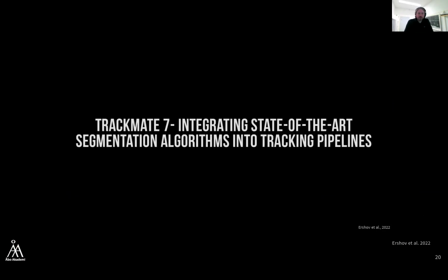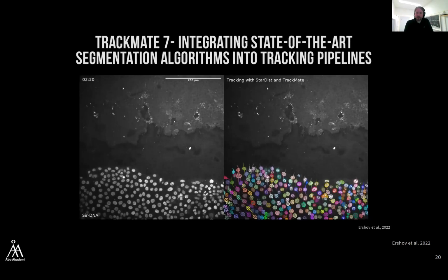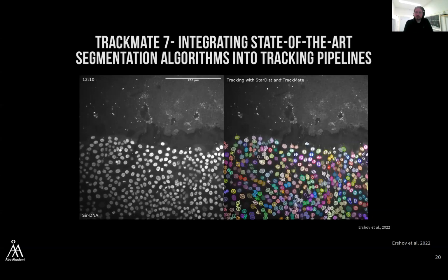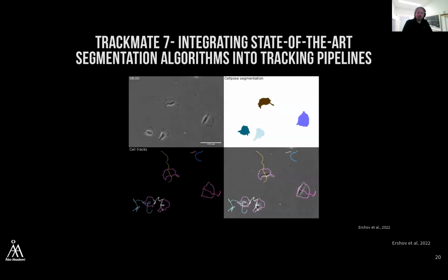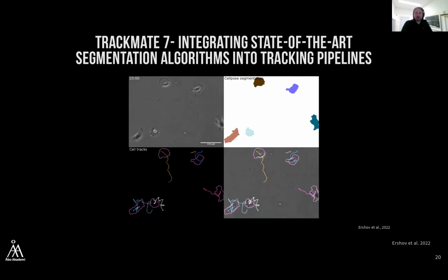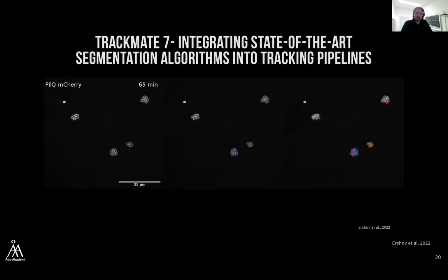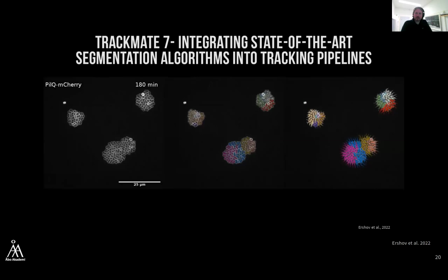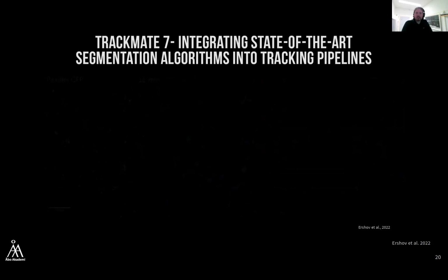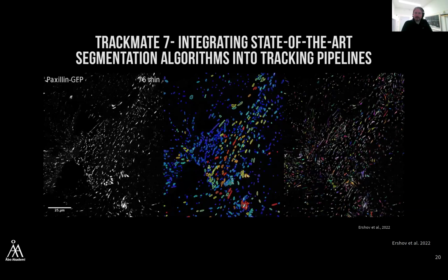So the other thing that we're very much interested in my lab, and you probably realize that from the introduction, is we are interested in following cell migrations, right? So we're interested in how cancer cells migrate over time. And the best way to analyze this kind of data using live imaging is to be able to track the cells. So we worked very closely with Jean-Yves Tinevez, who is working at the Pasteur Institute in Paris, France, with the main developer of TrackMate, some of you might know, which is a Fiji plugin to track.